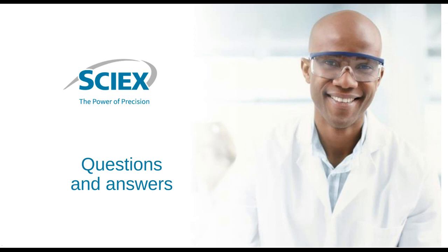Another one found that a shutdown method with gel that doesn't contain the dye actually extended the life quite considerably. So there is potentially some thought there that the dye resting in the capillary for extended periods of time is not ideal. But those are very simple tweaks that you can make to the shutdown method or to your buffer trace setup to just get some more lifetime out of that capillary and still get great results from every analysis.